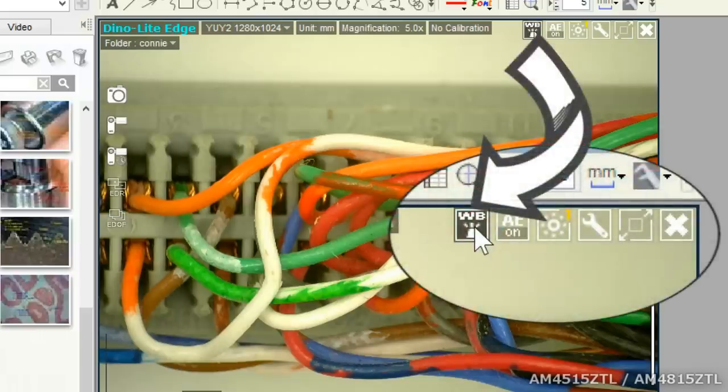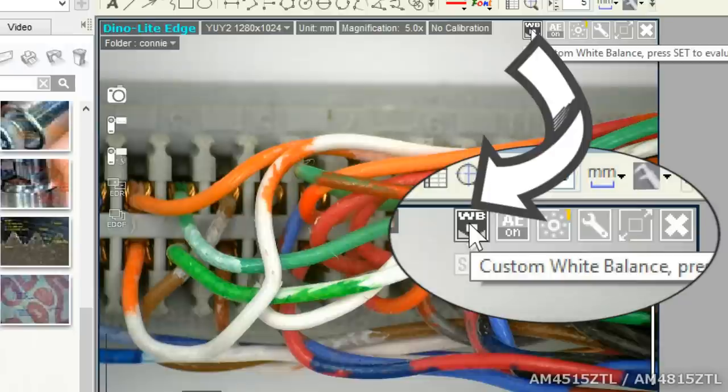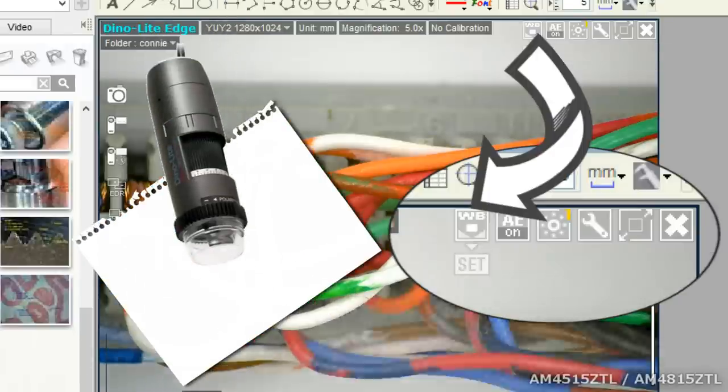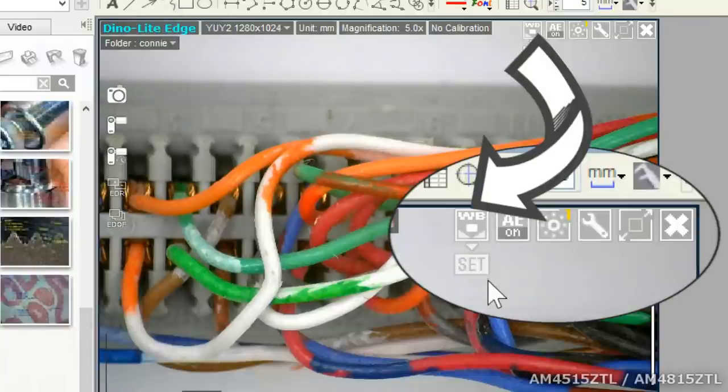When using these Edge Series DynoLite cameras, use the white balance feature to yield the best results. Click on the white balance button once for auto white balance. Click on it a second time for manual, place a white subject like a sheet of white paper in view, then hit set and see the results instantly.